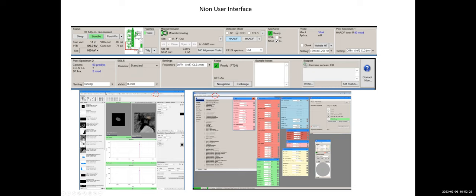You also have a few menus. And I want to emphasize Window, right? When you click Window, you see a lot of window options. And then if you choose them, they will show up on this right side. Like here is the Dectris EELS camera control. This is the panel controlling the EELS camera information. And then here is the Ronchigram camera control. It's controlling the CCD camera for looking at the Ronchigram. And then there are some special multi-acquire modules for data collection.